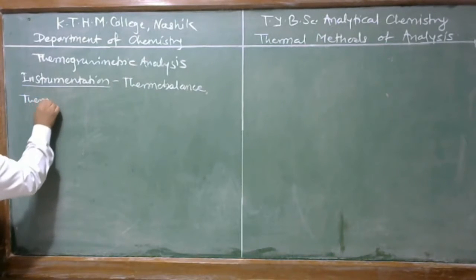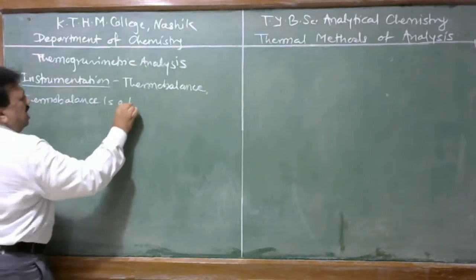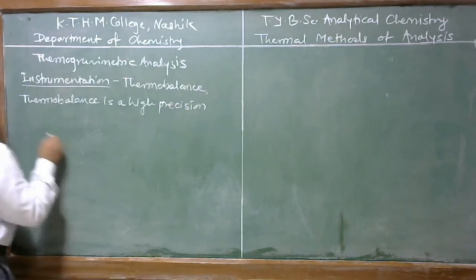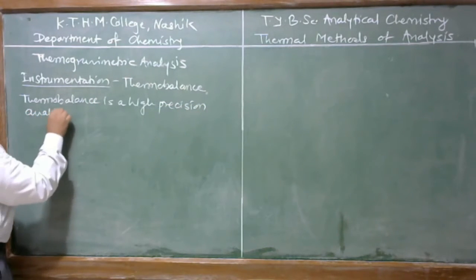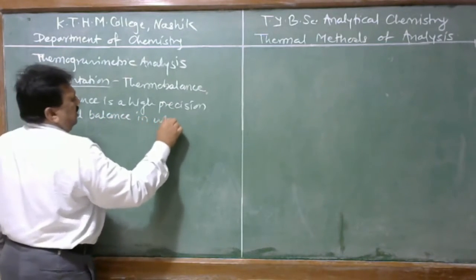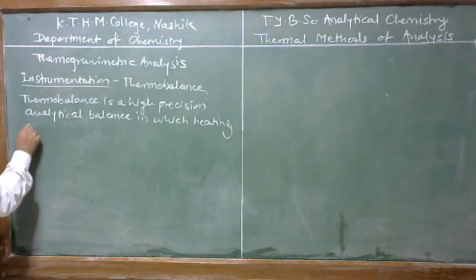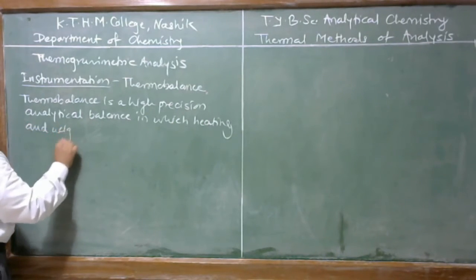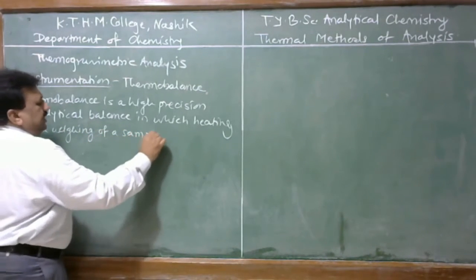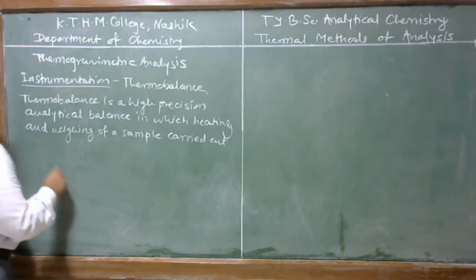Thermobalance is a high precision analytical balance in which heating and weighing of a sample is carried out simultaneously.